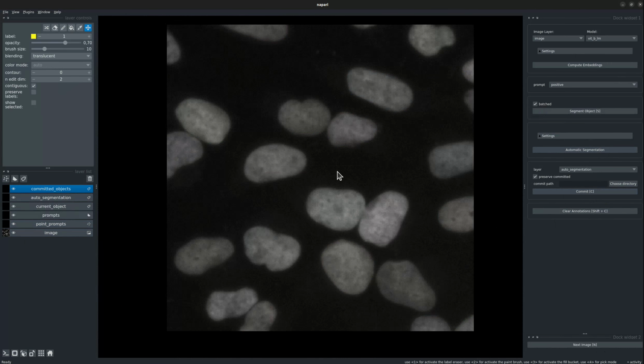This was the tutorial video for the image series annotator. Thank you so much for watching.